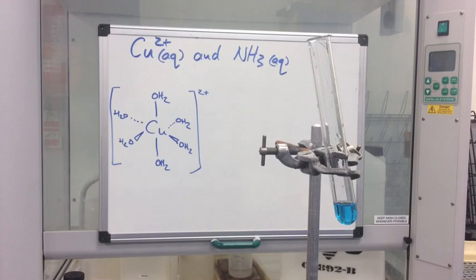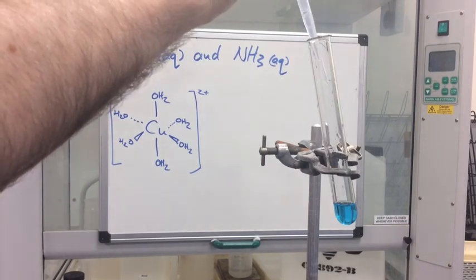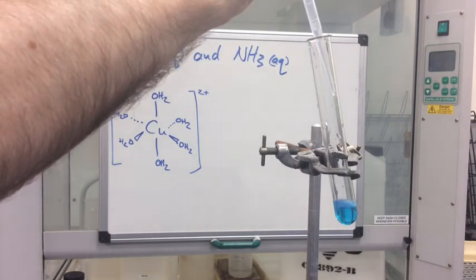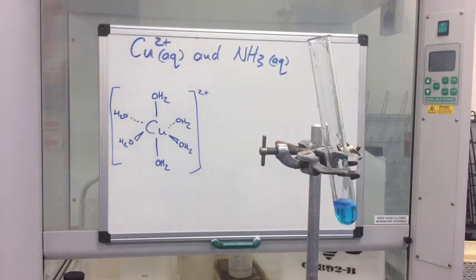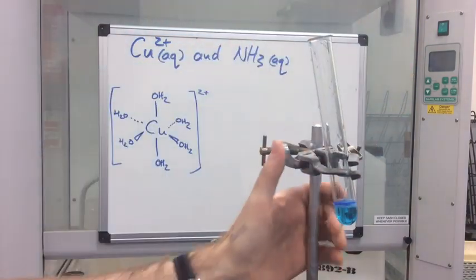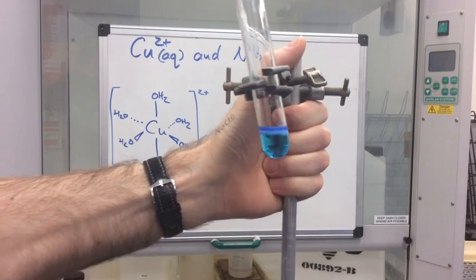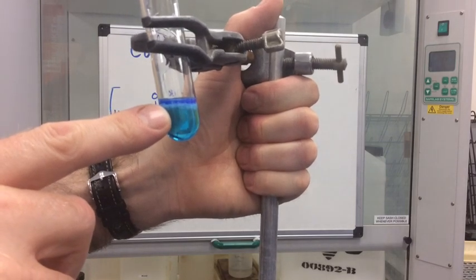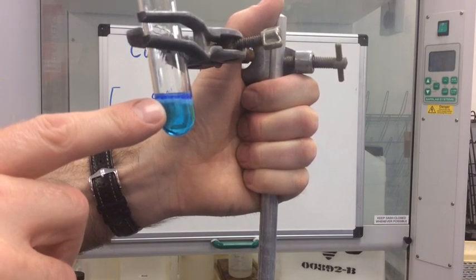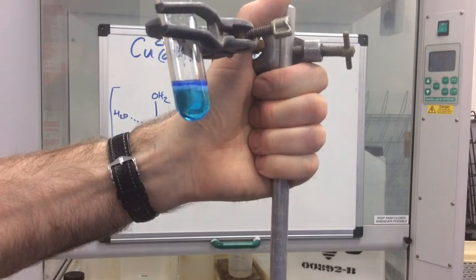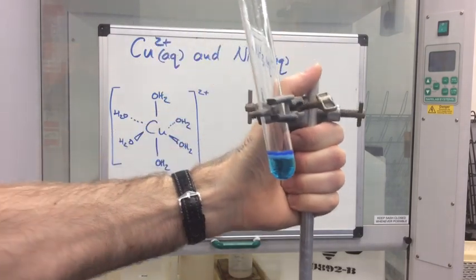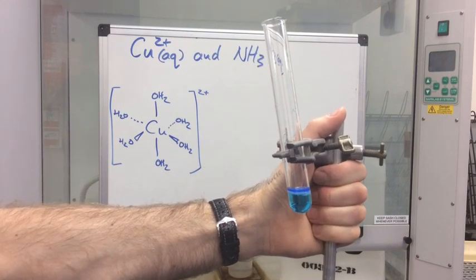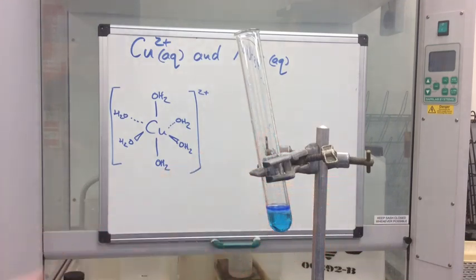I'm going to add a few drops of aqueous ammonia and see what happens. Hopefully you can see we've got a blue precipitate. We've seen this before when aqueous hydroxide ions react with aqueous copper 2+ ions — that is copper 2 hydroxide. I'll explain how that's formed in a moment.